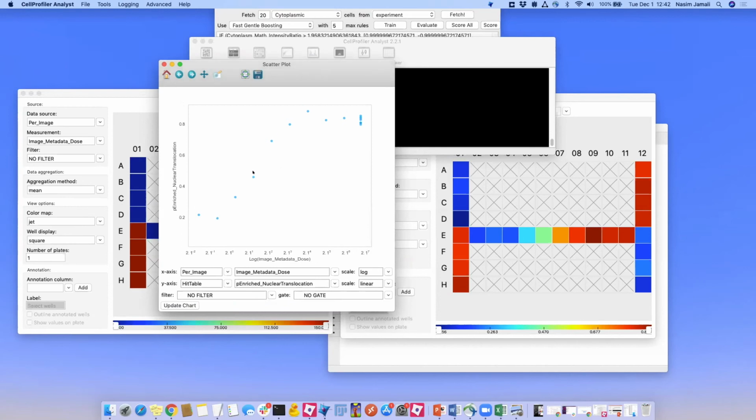I see a very nice log. And then I can ask, what is the minimum dose that would cause this translocation to happen? We see that's the highest dose. So still in these doses, the translocation does happen. So then we could say the IC50 is roughly around here, which is a lot less dose than the 150 micromolar that was picked before.